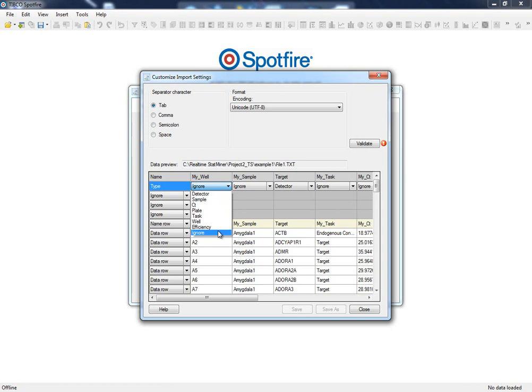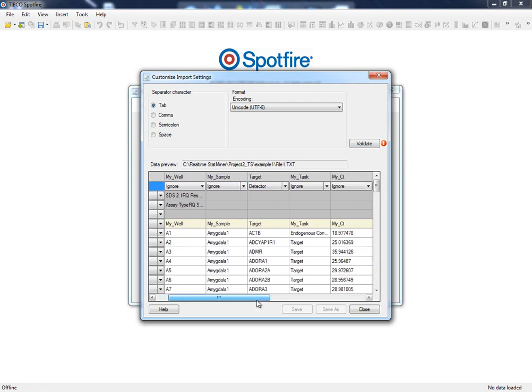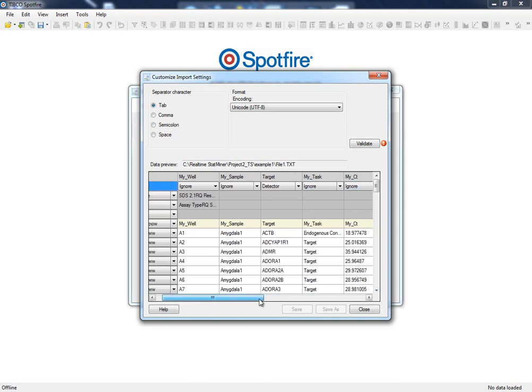StatMiner automatically tries to determine the type of the column and as we can see, the detector column has been properly detected. This is not similar to dealing with other mandatory information such as sample IDs and CT values where the custom names are not recognized by the application.